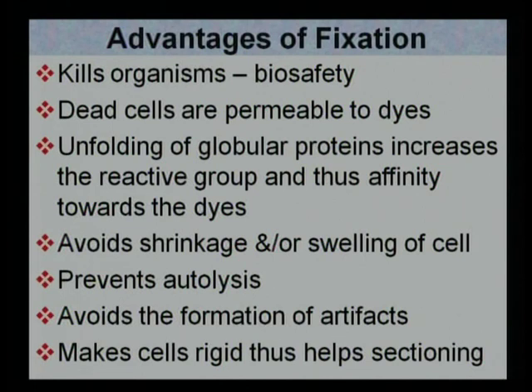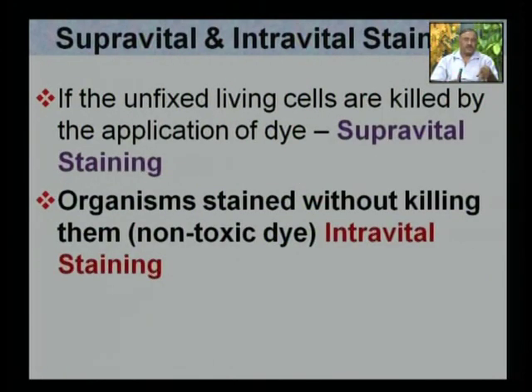Then another thing is, because the proteins and other things coagulate, it leads to unfolding of proteins, which increases the reactive groups, and thus in turn increases the affinity towards the dyes. Apart from these, there are other advantages: it avoids shrinkage or swelling of the cells, it prevents autolysis, avoids the formation of artifacts, and since it makes the cells rigid in certain tissues, sectioning becomes easy. So these are the various advantages of fixation.